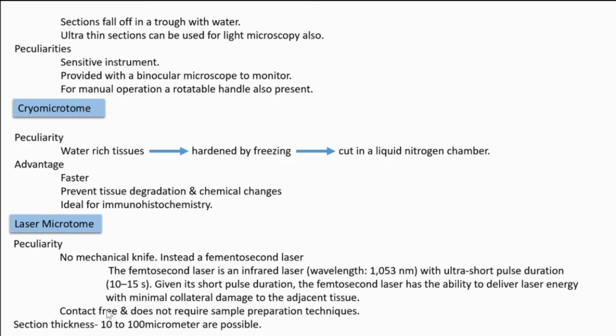It is contact free. It does not require any sample preparation techniques. All these are peculiarities. And the sections we can prepare with this laser microtome are 10 to 100 micrometer. Okay.